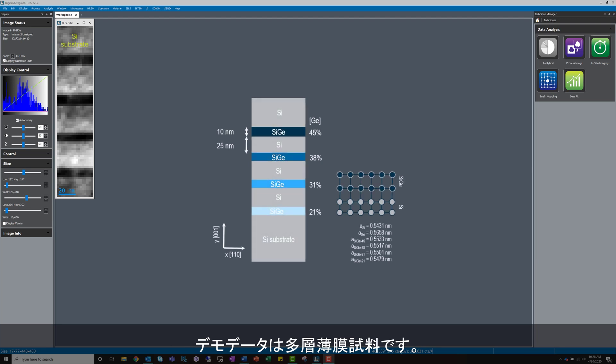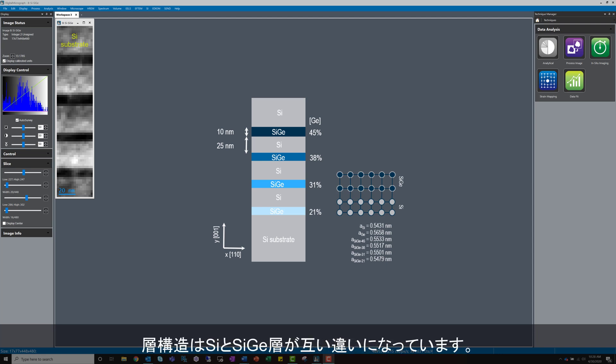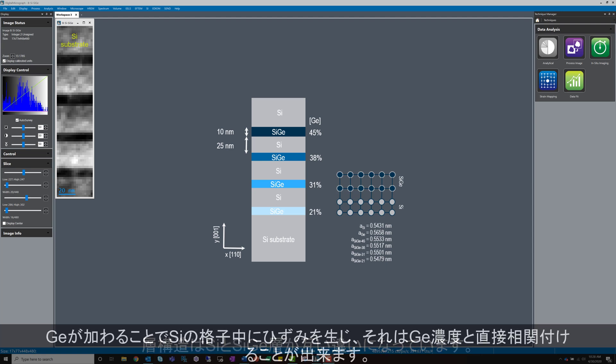The sample data here was captured from a multi-layer thin film sample, very common in the semiconductor industry. The layers in the data are pure silicon, followed by layers of germanium-doped silicon. Adding germanium atoms to the silicon induces strain in the silicon lattice, which is directly related to the volume fraction of germanium.